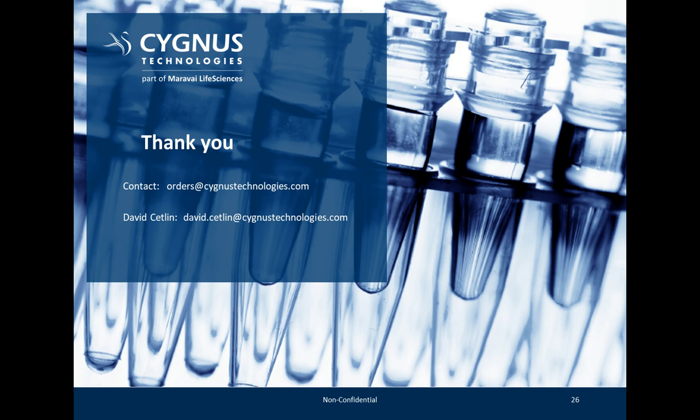So the first question is, how many experiments can I perform with the MockV MVM kit? That's a good question, and the answer really depends on the volume of your load and the concentration that you want to spike to.